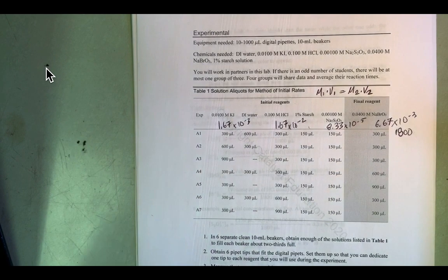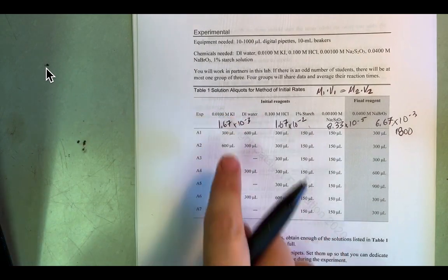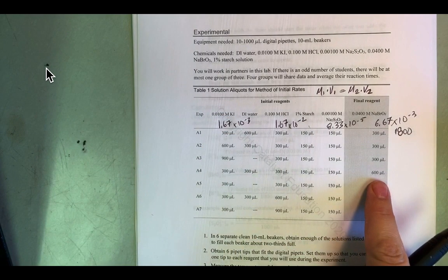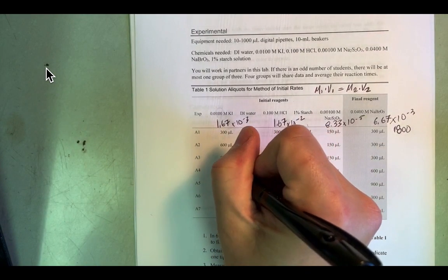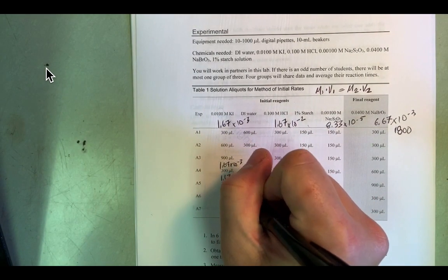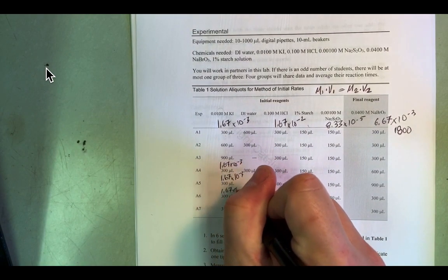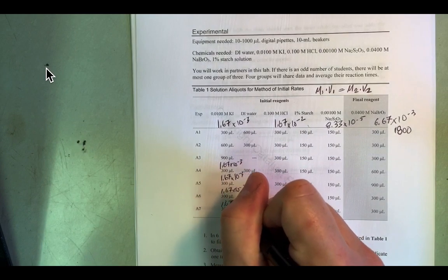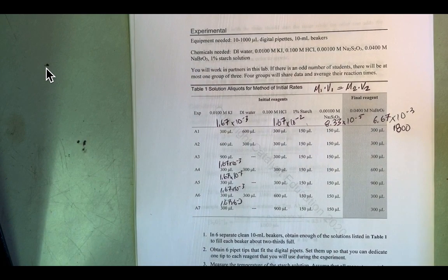So what's nice about this, and you can knock this out really quickly, is that, for one example, all of these have 300 microliters of the KI out of a total of 1800 microliters for the solution. So all of those are 1.67 times 10 to the minus 3. So all in that column that are 300 microliters are that same concentration.